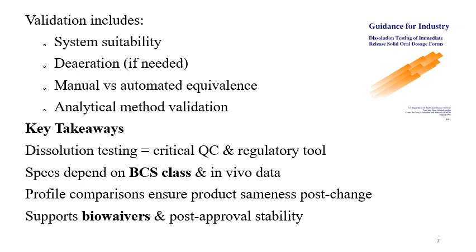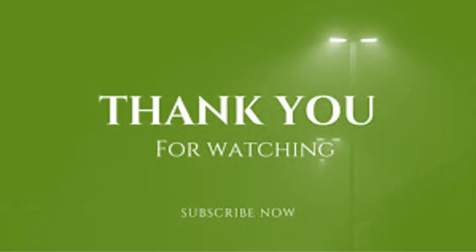Now see the main takeaways from this video. Dissolution testing is a very important and critical QC and regulatory tool, and dissolution depends on the BCS class and the in vivo data. Profile comparisons ensure product sameness after changes like SUPAC changes, and dissolution supports biowaivers and post-approval stability. So this is regarding the dissolution testing requirements as per the US FDA.